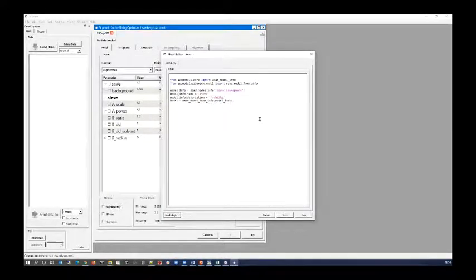And I don't know why you might want to do this, but let's say you wanted to combine the power law and the sphere. Let's do it with a cylinder, shall we? Cylinder. There we go. I can save that. Now, word of warning, it overwrites the model that we had there before.